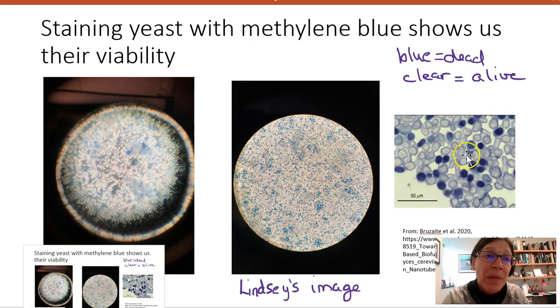And then this is a more finely focused image using a 100x objective from a research paper that I've given the citation for here. So that's the backdrop, or pre-lab talk, for this lab. Take a look at the other videos to see what else happens.